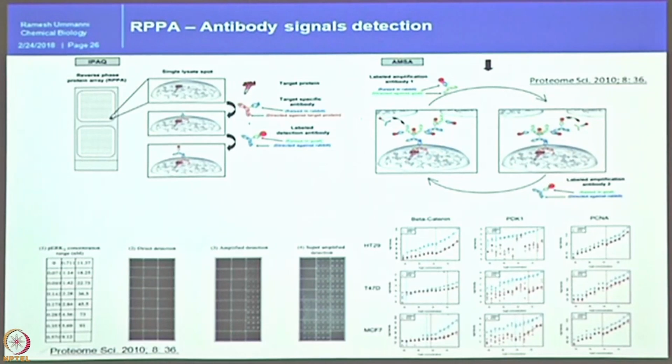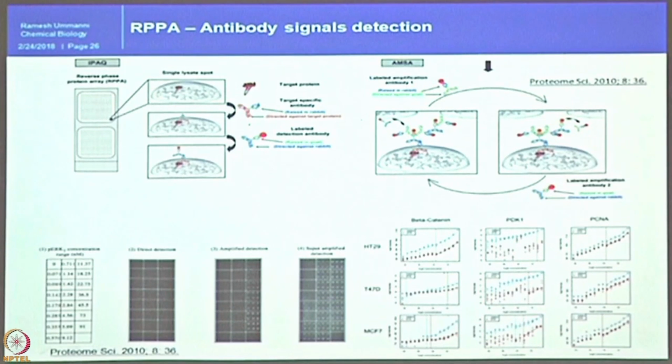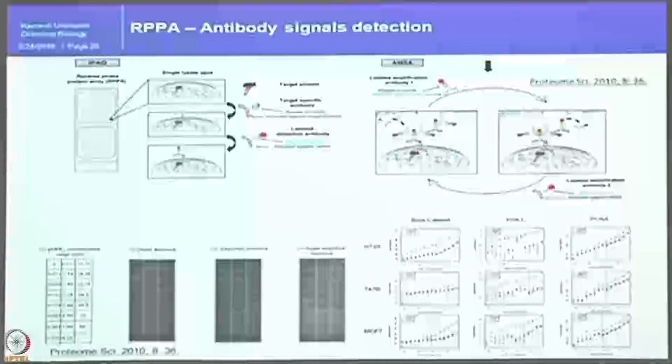Once the primary antibody is bound, let us say for example that it is from a rabbit. The secondary antibody added will be anti-rabbit raised in a goat. Then again we select a third antibody, which is raised in rabbit against goat. So now imagine that one label molecule became two label molecules.